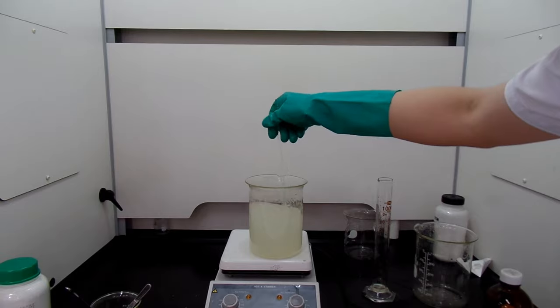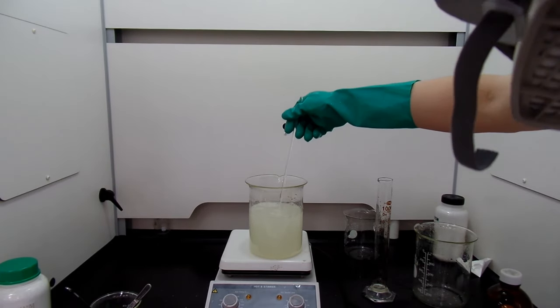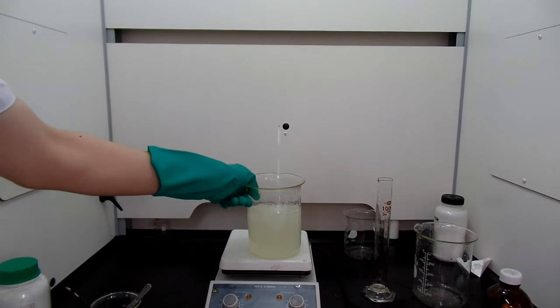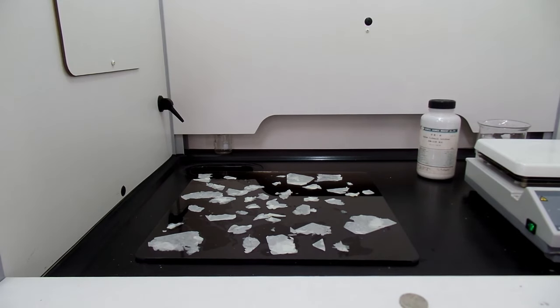I don't know the exact reason, but I think this happened because the addition of water caused the substituted nitro groups to revert back to hydroxy groups. You can see later in the video, the second nitrocellulose powder that I made really struggled to ignite. It took about 2 days for me to dry all the nitrocellulose because the air is quite humid in here.